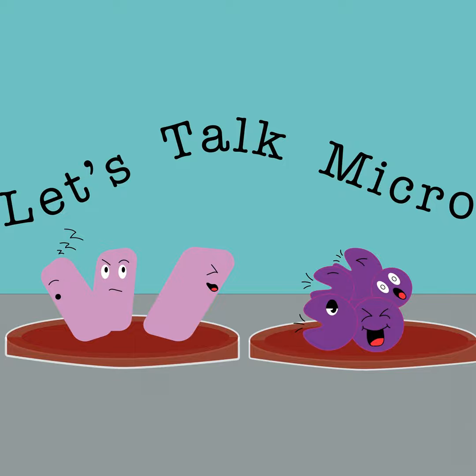Okay, so since there are two options for remote learning, and maybe this will be more for you, Kathy, since you got to work with both, do you find that one worked better than the other, or they worked about the same? I think they were both different experiences. They would never have been able to operate an electron microscope without the scope program. So that gave them that layer of things. And I think that when you're actually physically doing something.